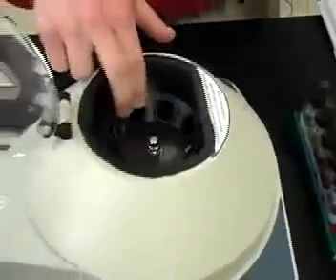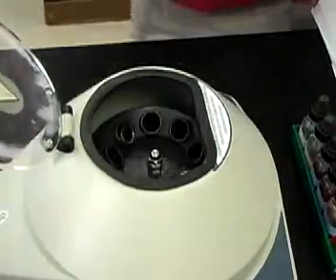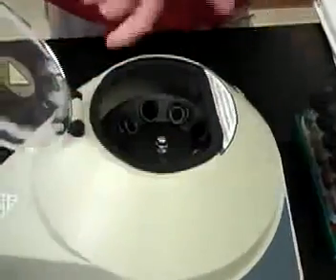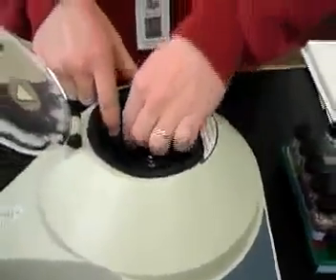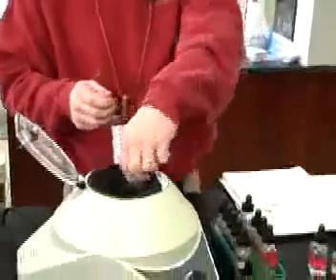And if you want to centrifuge more than 2 things, this can hold up to 8, you could partner with somebody next to you and put their solution opposite. Or some people like to run 2 or 3 trials at the same time, and maybe you want to have the other people put theirs opposite of yours. One goes this direction, one goes opposite, and they just have to be all equalized out throughout the centrifuge. So if you're going to centrifuge 3 things, you can do that. Just make sure that they're at 120-degree angles to each other.